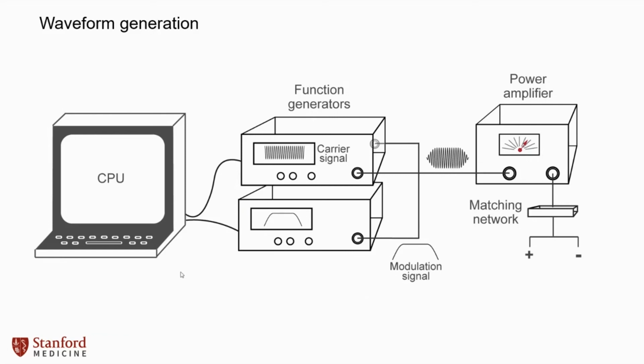Okay. This is a little bit less for our human researchers, so I'll try to be quick about it. But for the animal researchers, how do I think about ultrasound hardware and what do I need to get started? If you're in the human sector and you have access to an animal lab, maybe this will be helpful for you to think about how much you have to set up to get this going. And it's really not a whole lot. You can set this up on a pretty low budget. For my own work, the majority of the equipment is shown here.